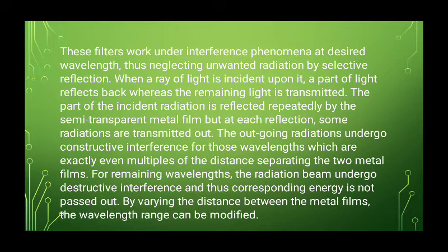The part of the incident radiation is reflected repeatedly by the semi-transparent metal film, but at each reflection, some radiation is transmitted out.